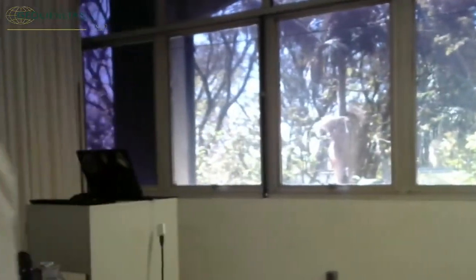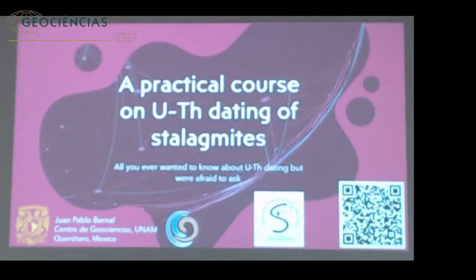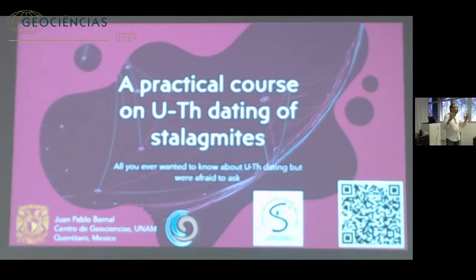In this talk, I'm going to be telling you, it's a continuation of what Kathleen discussed. She went ahead of me and asked for a raise of hands of who has done any uranium thorium dating. Not many of you have, but now you have the basic principles of the dating, and now we're going to get more into how you obtain your data and how you work with your data in a more practical sense.